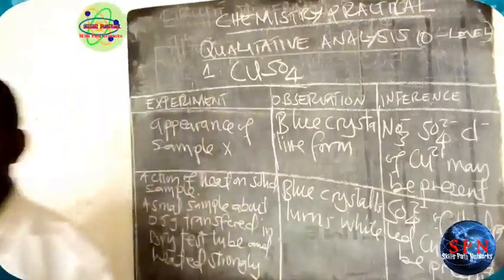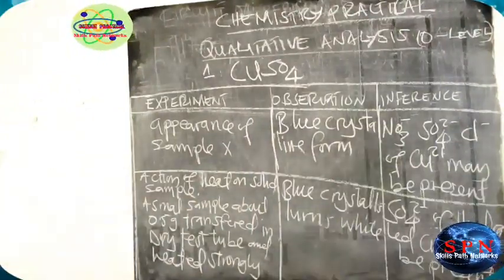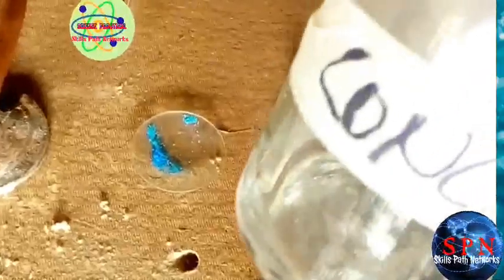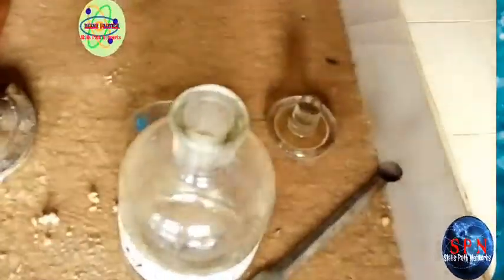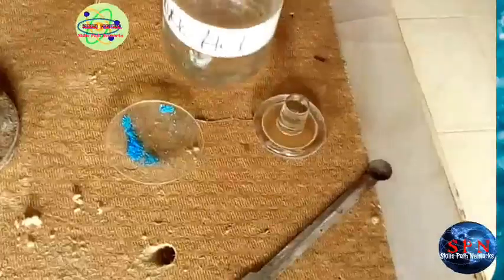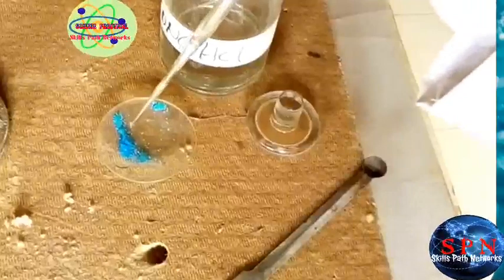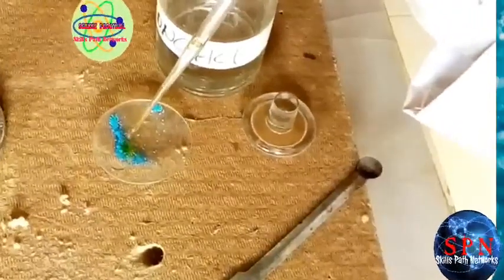Let's go. This is sulphate and hydrochloric acid. You mix with your salt.